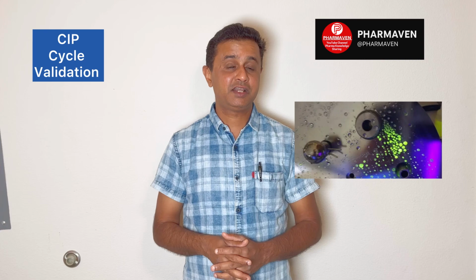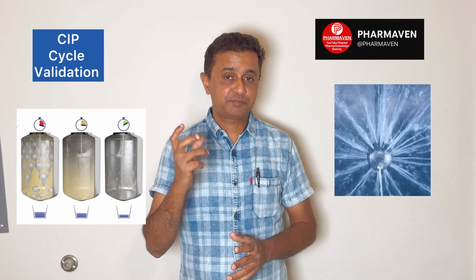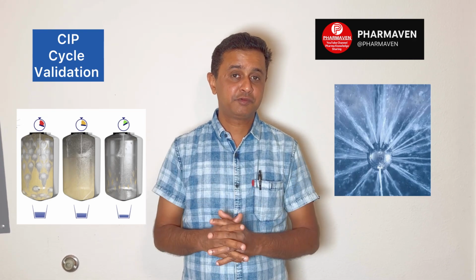And once we have done that, if you throw the UV light on it, you can see the green color fluorescence. So this green color fluorescence indicates that Riboflavin solution is there. You should allow it to dry, and after that, you perform the CIP cycle. So the CIP cycle involves a spray ball through which the entire surface within the manufacturing vessel or formulation vessel will be rinsed.